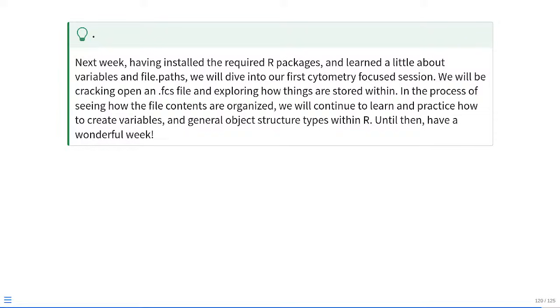So many of us work quite extensively with FCS files, but not so many of us actually know what's within an FCS file. So next week we'll be taking a look inside the FCS file, kind of see what the major structural elements of an FCS file are, like where all these keywords we set in go. Can we actually look up the gain or the voltage settings that that particular FCS file had for a particular day? How do we get back the actual raw MFI values? How do we see if our user was running something on low, medium, or high acquisition speed?